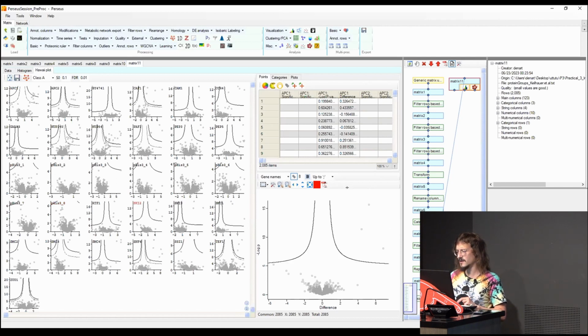Here you can then select, again, as usual, which proteins these are. Then you have the information about your bait here that also will have positive log-fold change too.